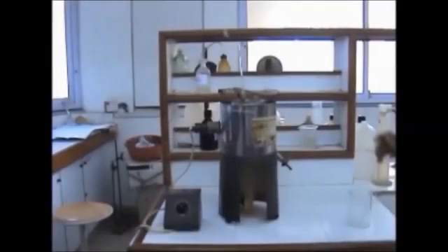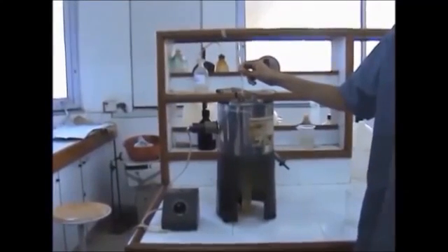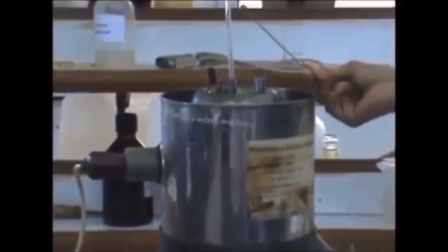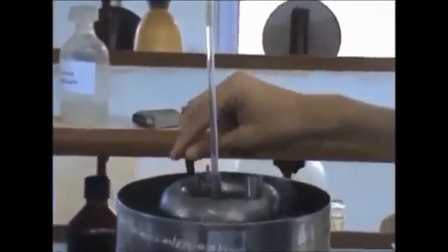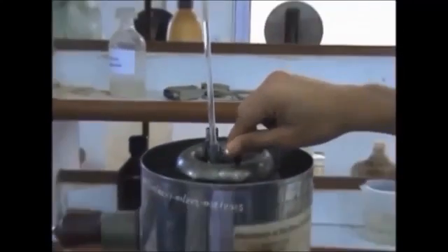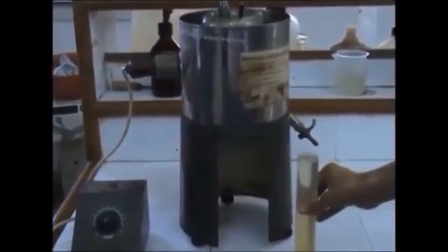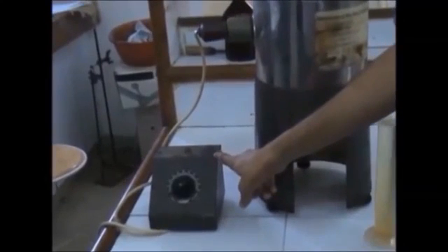Okay friends, we now proceed with the first experiment based on Redwood viscometer 2. Let's take a look at the apparatus. Starting from the top, we have the thermometer so that we can test the viscosity at equal intervals of 10 degrees. Then we have the stopper for the little hole at the bottom of the vessel holding the lubricant. We need to keep stirring the water of the water bath continuously to ensure the uniform distribution of heat. At the bottom, we have the measuring cylinder to collect pre-determined equal quantities of the lubricant that flows through the orifice. The source of heat is an electric heating coil and the temperature is controlled by this regulator.